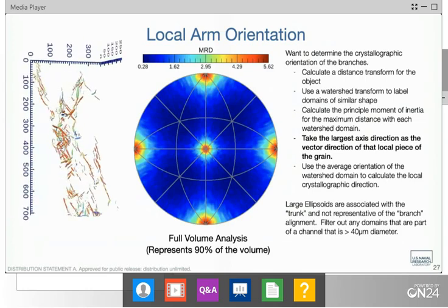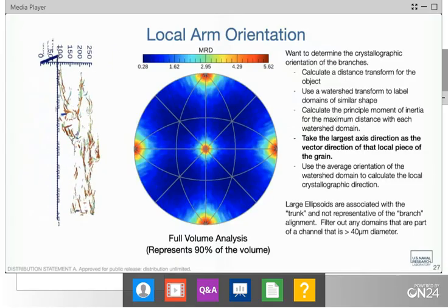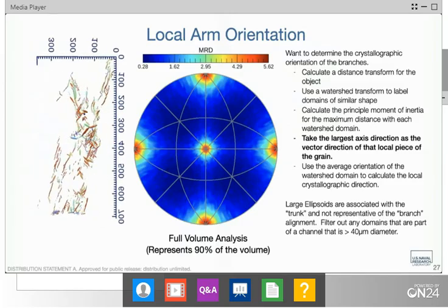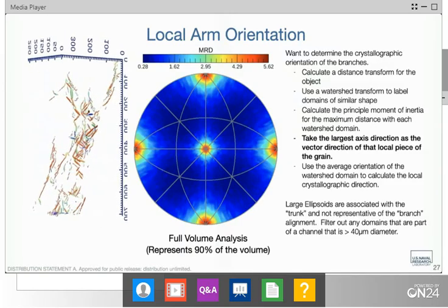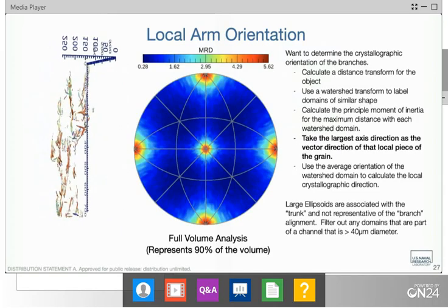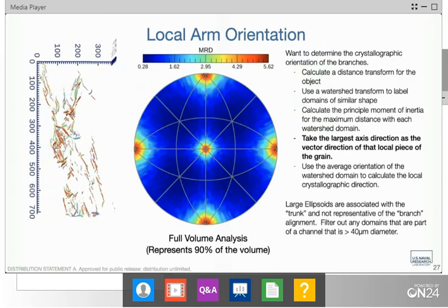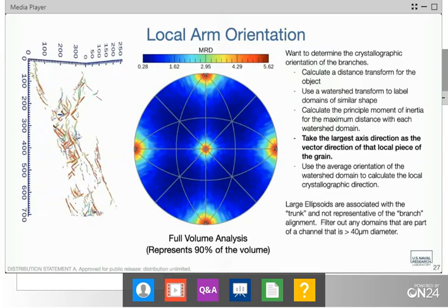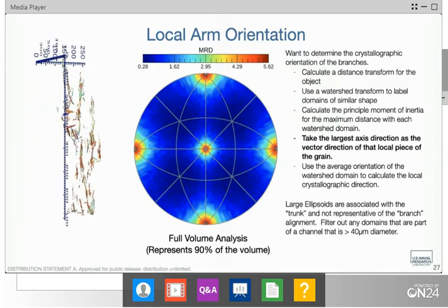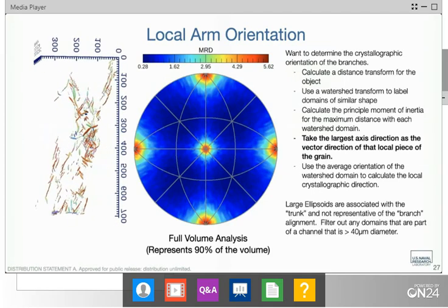That is backed by some work that we've done with Tony Rollett, where he's looked at some synchrotron experiments and looking at the solidification path for 316. And it's dependent upon how quickly you're printing, but at these very high cooling rates, they were seeing only an austenite microstructure. And I think that actually applies as well to the powder. And it may very well be too that the powder is getting hot enough from subsequent passes that it is maybe transforming.